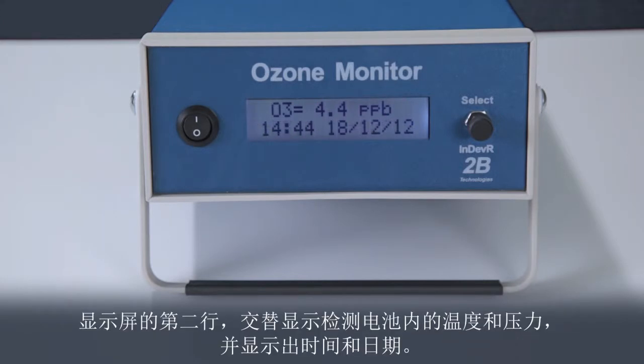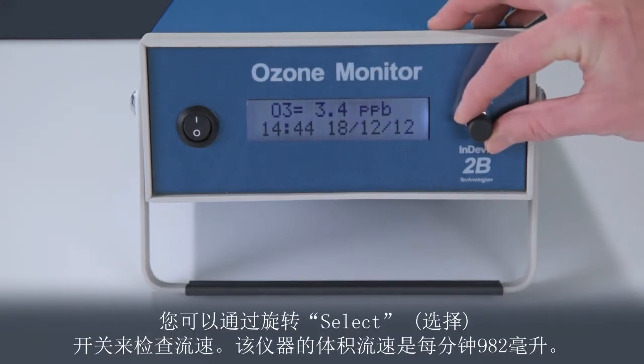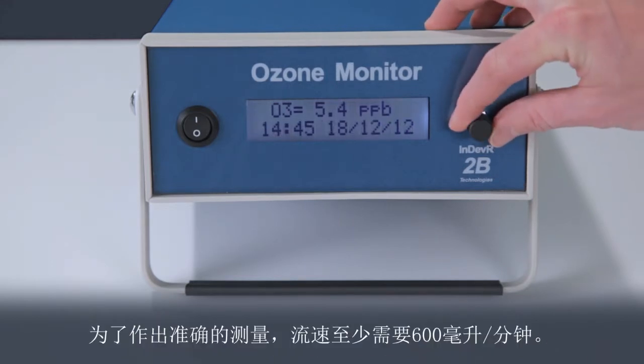The second line of the display alternates between showing the temperature and pressure inside the detection cell and showing the time and date. For this ozone monitor, the cell temperature is 33.9 degrees Celsius and the pressure is 809.8 millibar. You can check the flow rate by rotating the select switch. For this instrument, the volumetric flow rate is 982 cc's a minute. The flow rate needs to be at least 600 cc's a minute to make an accurate measurement.